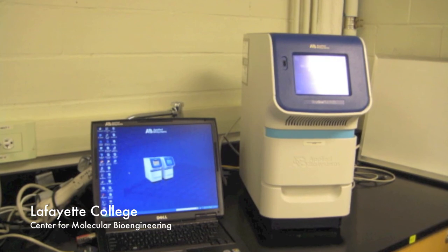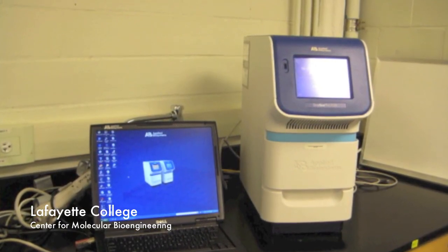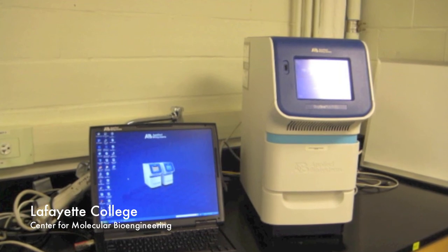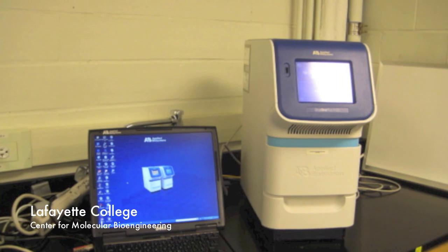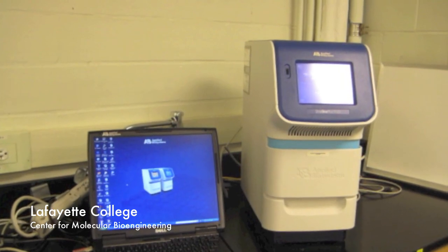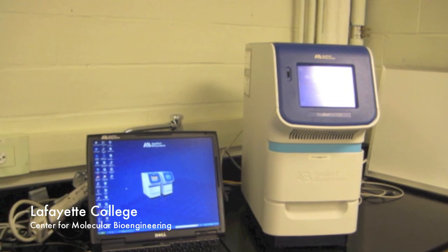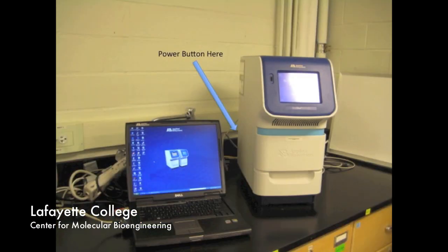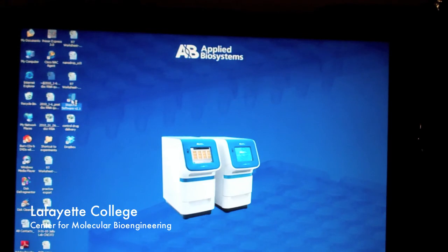In this video, you will learn how to set up the Applied Biosystems Step 1 Plus thermocycler and software for the RT reaction. While you are setting up the machine, make sure your samples are on ice. To begin, turn on the computer and the thermocycler. The power button for the thermocycler is located at the left rear of the machine. This will take a few minutes.